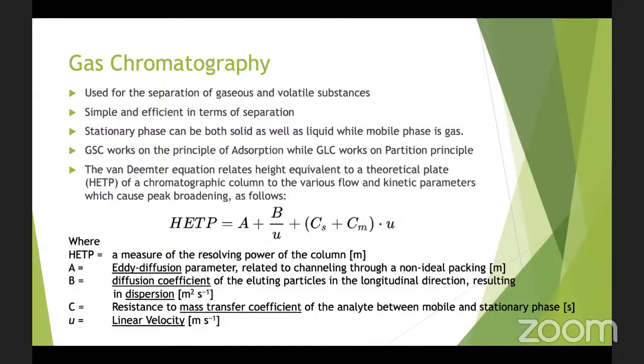Now, further, we have longitudinal diffusion. In longitudinal diffusion, the mobile phase is diffused longitudinally, thereby causing a turbulence effect. That is, there would be higher concentration of the solute in the middle, whereas lower concentration at the edge. In the liquid phase, the diffusion is less, but in the gas phase the diffusion is more. Why? Because the gas takes the shortest route.